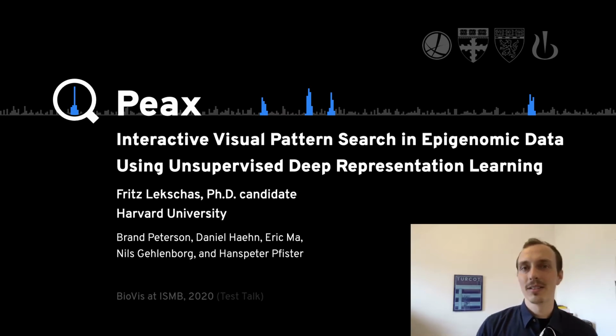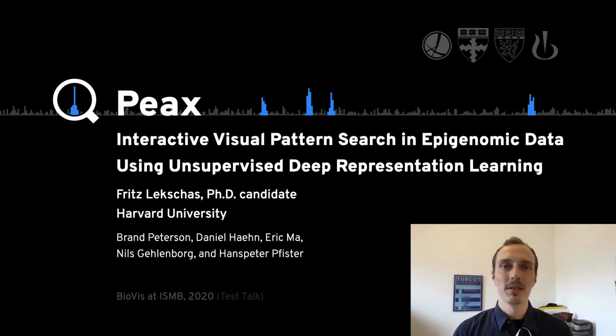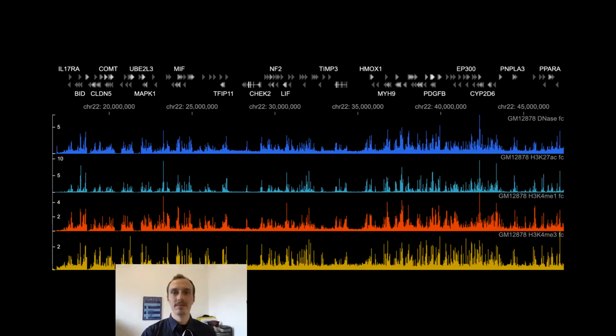Hey there, I'm Fritz, a PhD candidate from Hans-Peter Pfister's Visual Computing Group at Harvard University, where I work on visual exploration systems for genomic data. In this talk, I'm going to present Peax, a tool for interactive visual pattern search in epigenomic data that is using unsupervised deep representation learning. This work emerged from a collaboration with Novartis Institutes for Biomedical Research and Harvard Medical School.